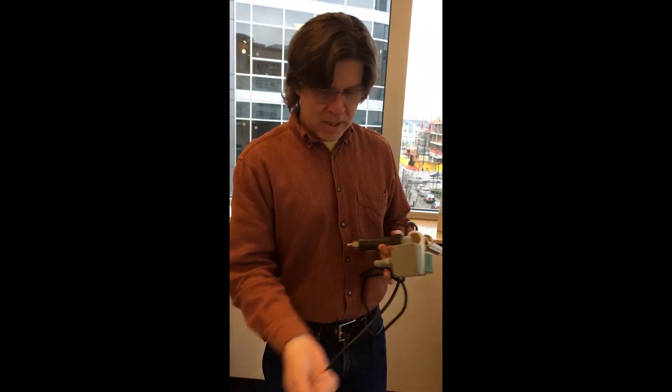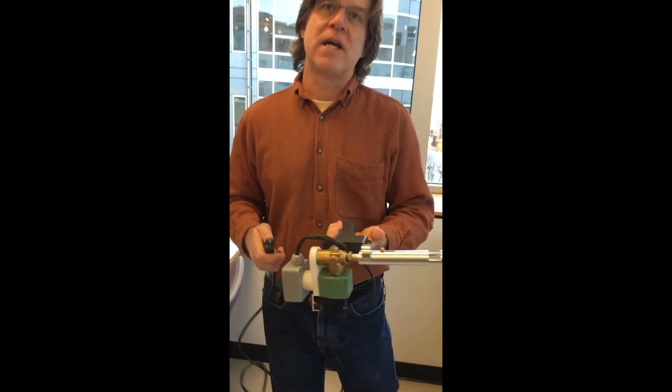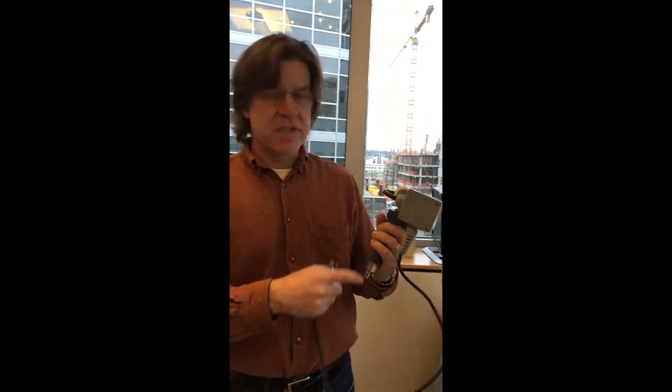Then what you do is you plug this into the outlet, and that's what the trigger operates on. So pushing the trigger will release a stream of helium, which is attached to this gun.